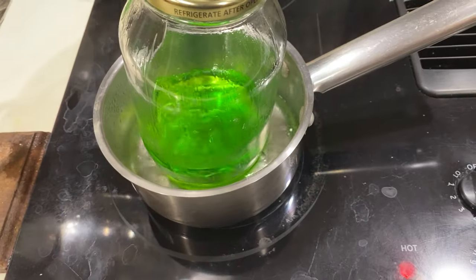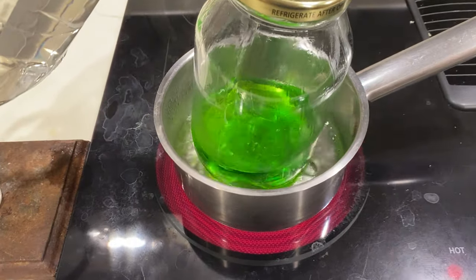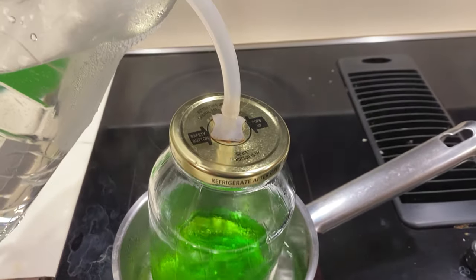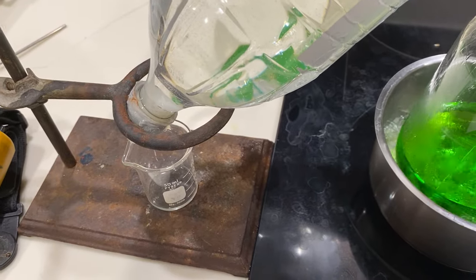We're heating it in water so that it's more indirect and it's not receiving direct heat, so that we can control the temperature a little easier. It'll evaporate in this jar, rise up the tube, condense, and drop into this little container.